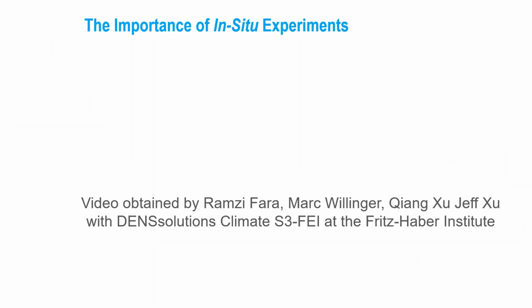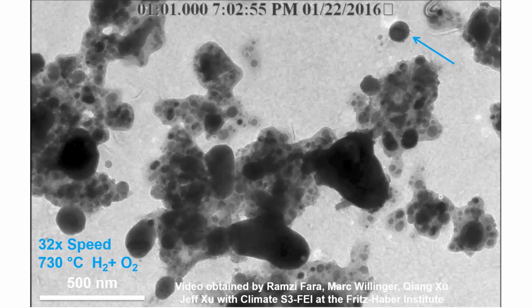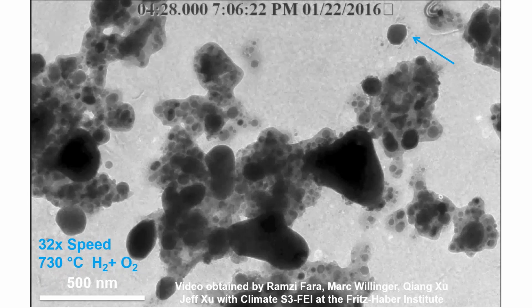So that's what in-situ means at Gatan, but why do in-situ experiments? Why is this a really valuable thing for us to focus on and for you to focus on as a researcher? So I really like this video taken at the Fritz Haber Institute several years ago now, back in 2016.